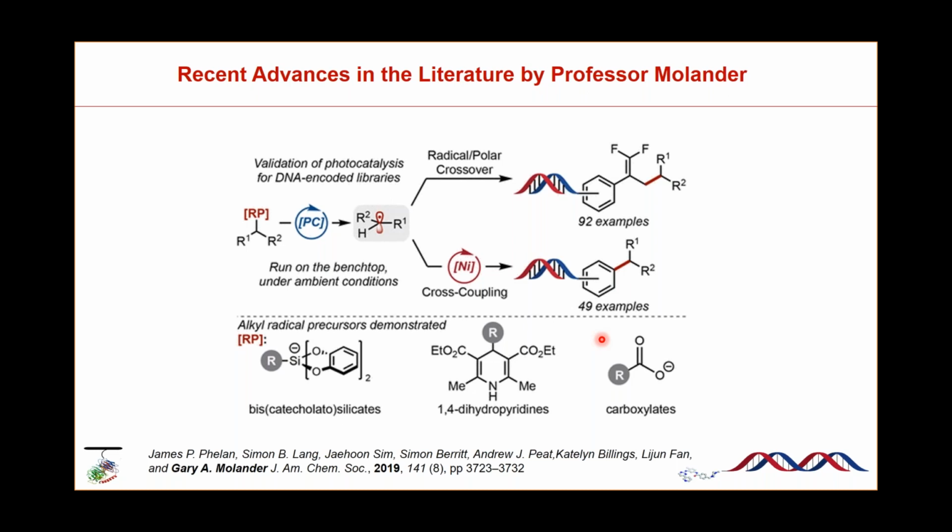This work, collaborated with GSK, adequately demonstrated that all these types of normal chemistry are also compatible. We are really excited to see these results, and my group sees this reaction works perfectly. We are trying these conditions in plate format for DEL reactions, and hopefully we can find hit compounds with this chemistry, right?